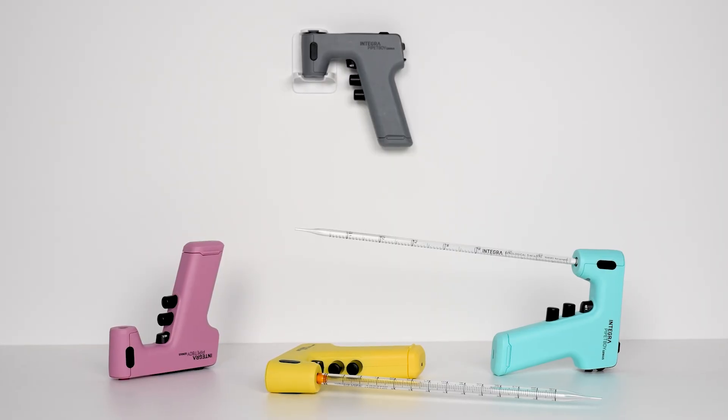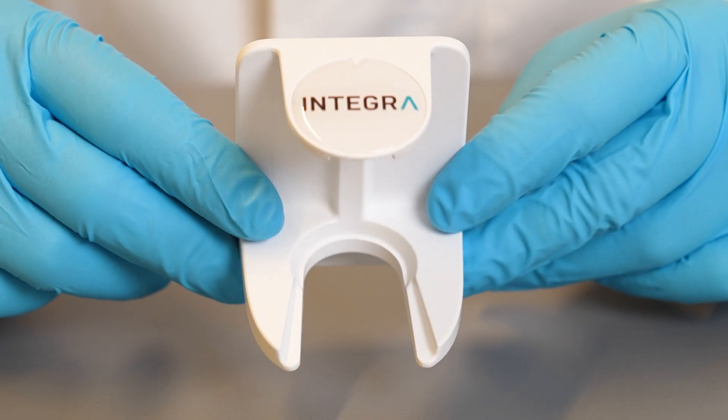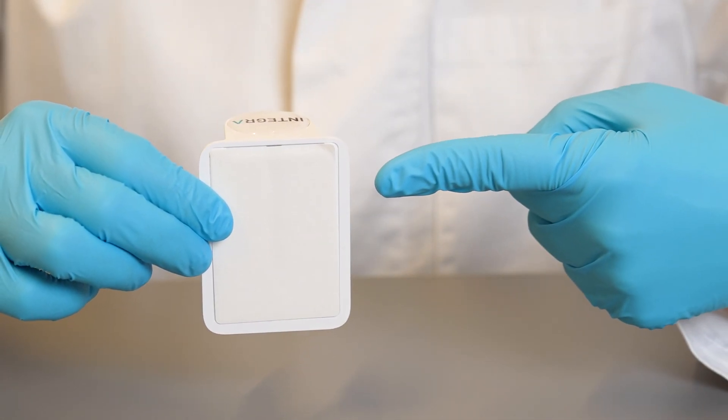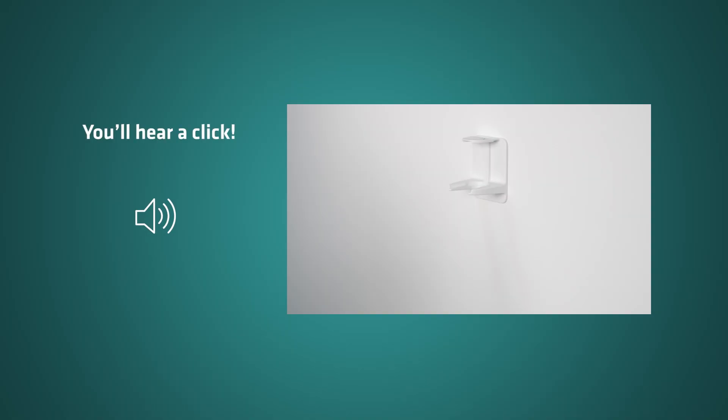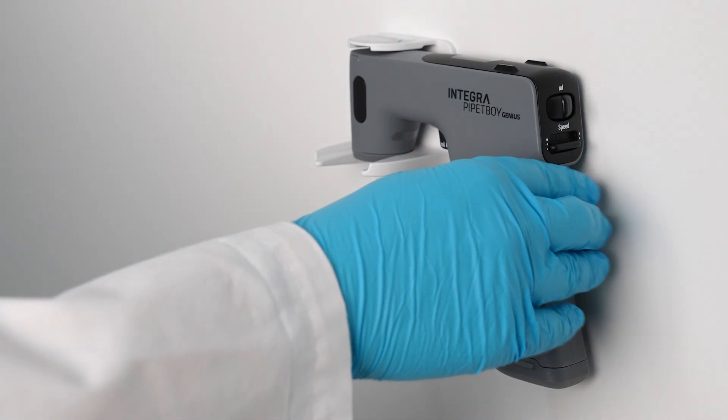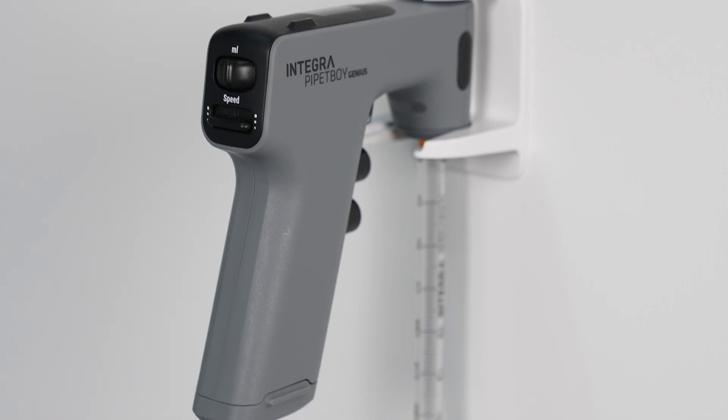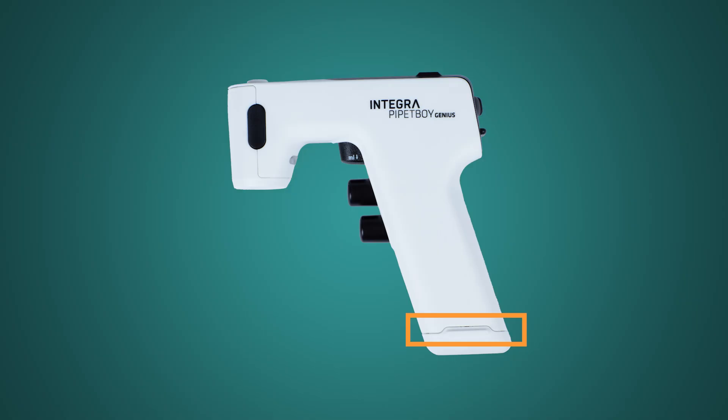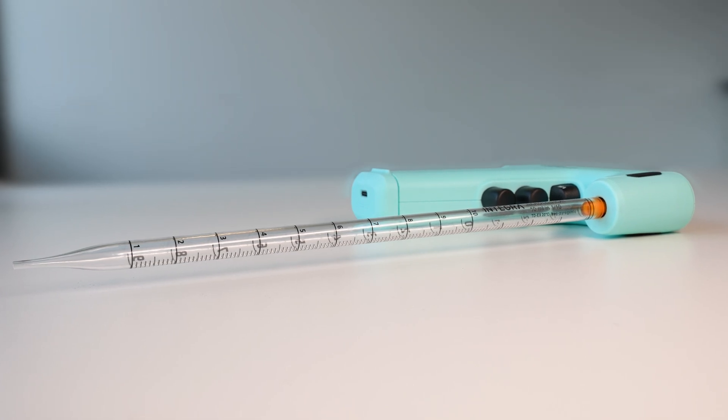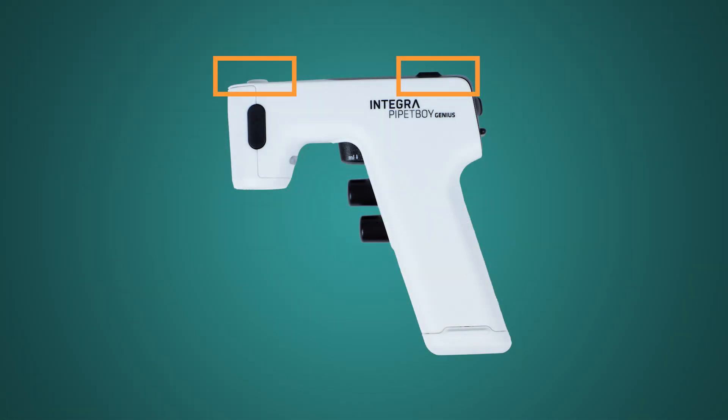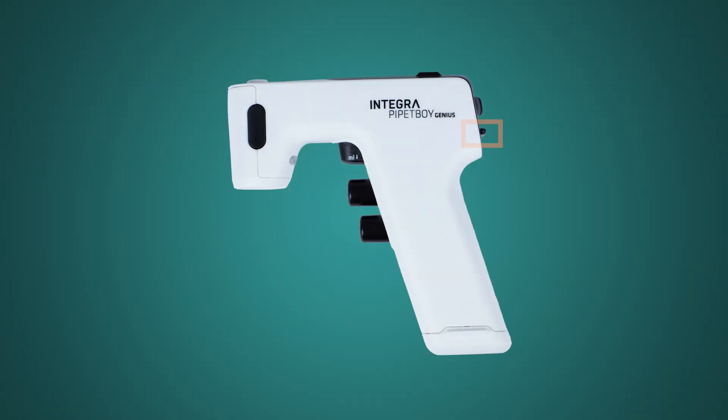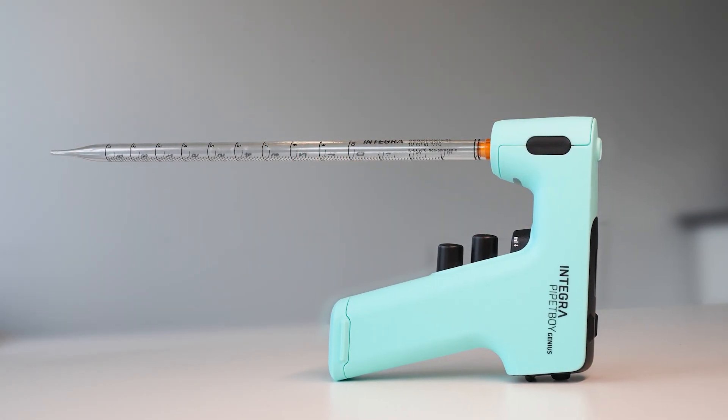Between use, the Pipette Boy Genius can be stored in many ways. Firstly, every instrument comes with a wall mount which can be installed using the strong adhesive on any clean vertical surface. You should hear or feel a click when the Pipette Boy Genius is correctly attached to the wall mount. The controller can be mounted at any angle to the wall to save space, and you can even leave a pipette in the instrument. The Pipette Boy Genius also has built-in ledges on the sides allowing it to be placed on the bench with an empty pipette inserted without touching any surfaces. The instrument can also be placed on the bench upside down to save space. It's even possible to lay the Pipette Boy Genius on its back with an empty pipette, whatever's most comfortable for you.